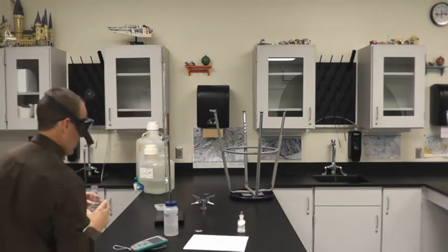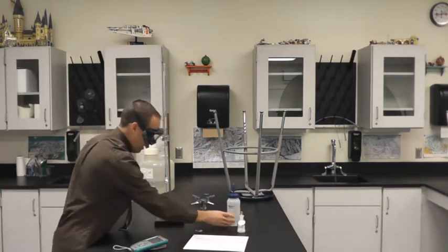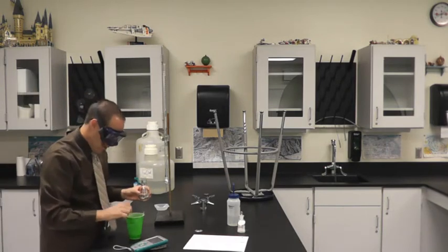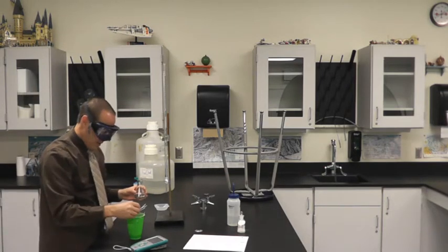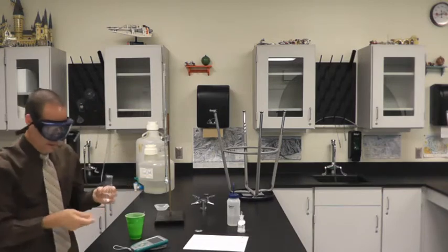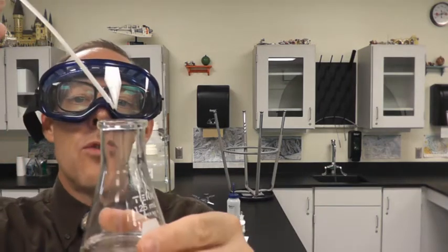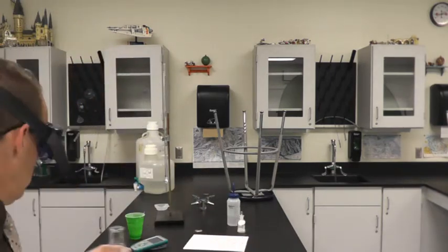So the next step, and this is probably the most important here in titration, is you have to, have to, have to add indicator. So I have some phenolphthalein here. It is the stuff that's actually going to make this turn pink in the presence of hydroxide ions. So I'm just going to drop a couple drops of this in here. And we don't need much.